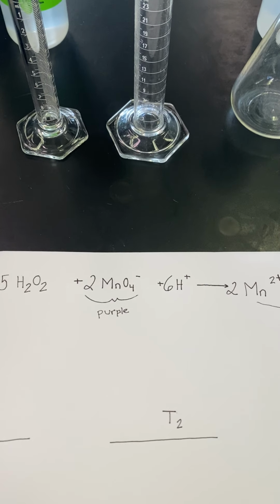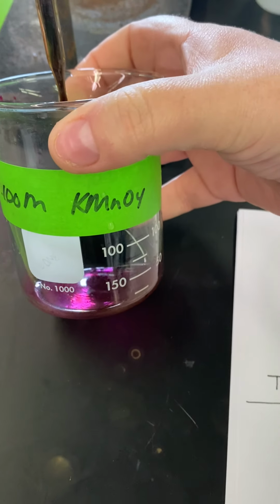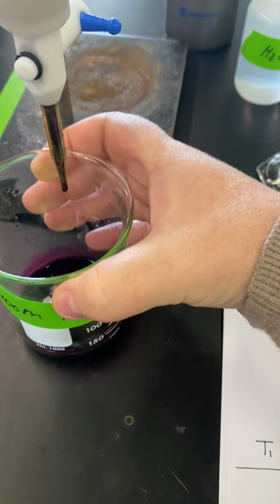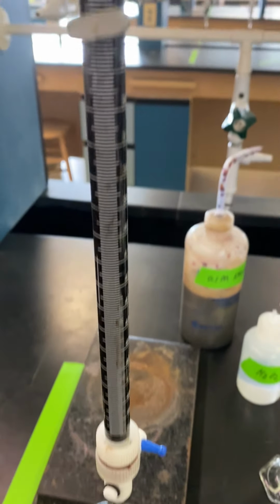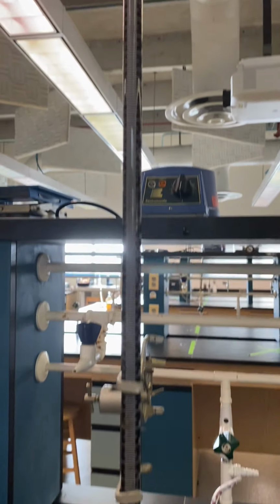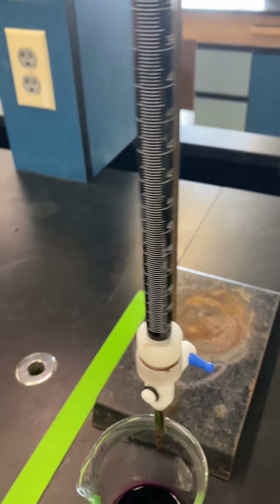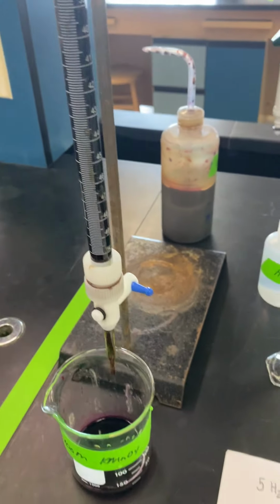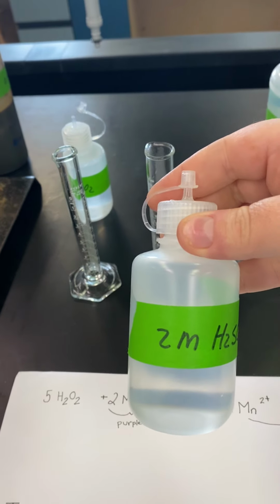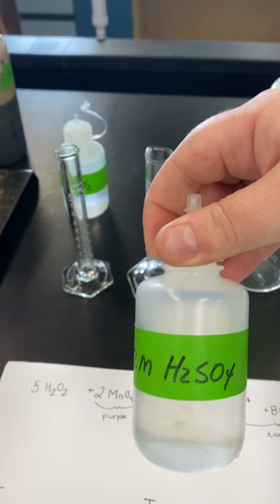Okay. So to do this experiment, guys, what do we need? We need a 0.100 molar concentration solution of the potassium permanganate, and like I said, it's this beautiful purple solution. And that solution, guys, I already have filled up in my 50 milliliter burette. Okay, you can see it's very dark and I've got it filled up. I also have some backup in this squirt bottle just to kind of keep the mess at bay, but it's still messy. Okay, I also have a squirt bottle of 2 molar sulfuric acid, and guys, sulfuric acid is a strong acid, so we always have to be careful when we're working with it.